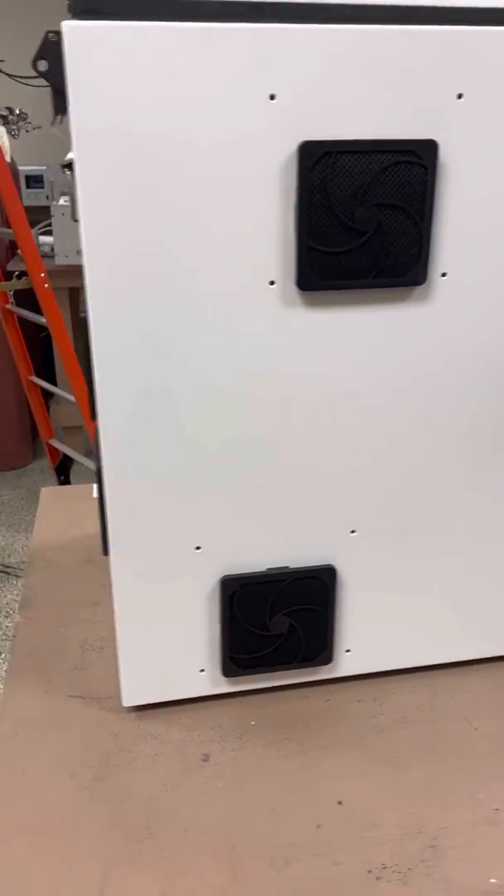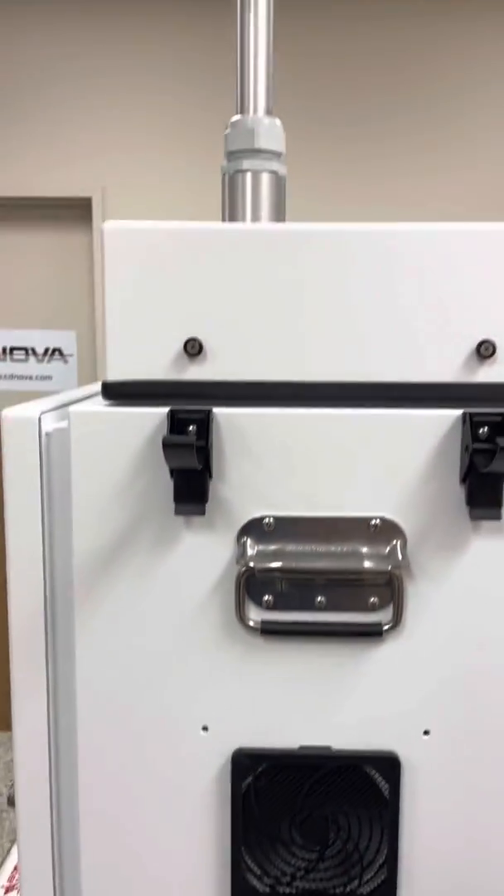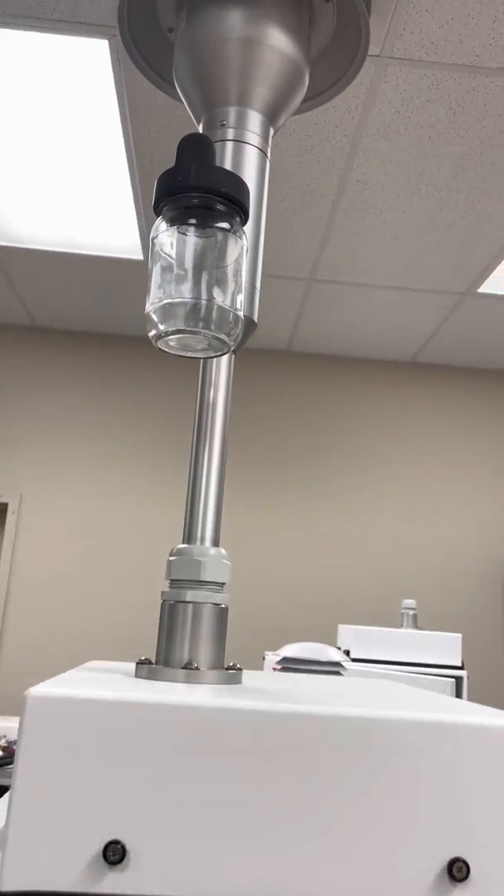On the back, we have the cooling vents, and around the side we have some more cooling vents. Up at the very top, this unit has a PM10 inlet.